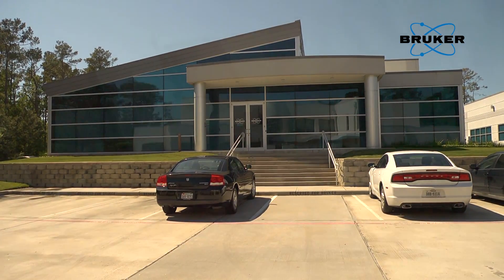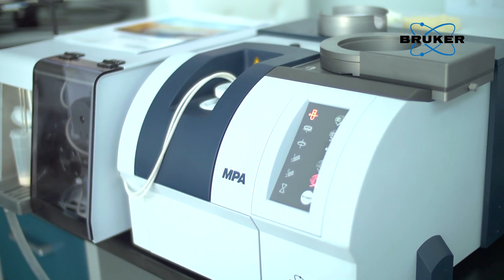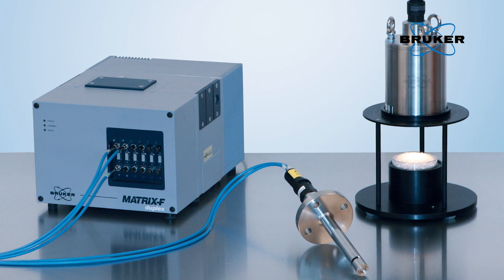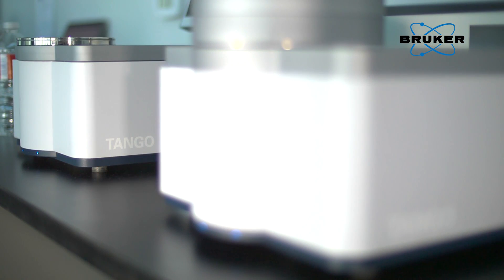Bruker's FT-NIR product line includes the Tango, the MPA, and Matrix I spectrometers for lab and at-line applications, as well as the Matrix F-Series for process control. Faster, simpler, more secure.